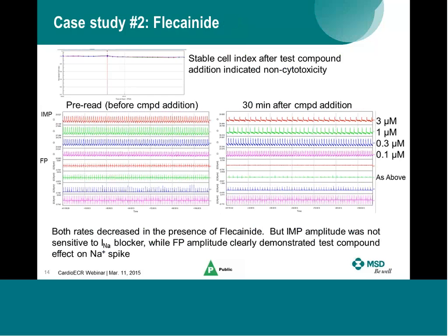But I want to bring your attention to the amplitude. So in that case, the impedance amplitude was not very sensitive to sodium channel blocker flattening, while the field potential amplitude clearly demonstrates test compound effects in a concentration dependent manner.